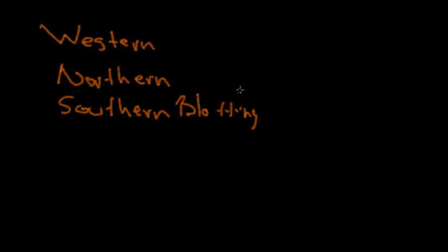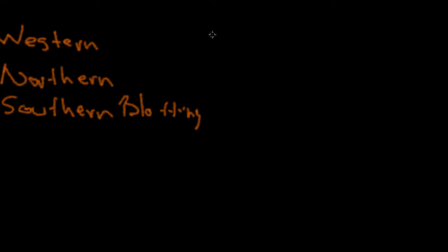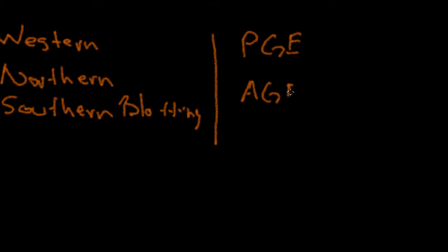And then some of their kind of precursor tests: polyacrylamide gel electrophoresis and agarose gel electrophoresis, and how that all works, and what is its various role in understanding what's going on with the gene.